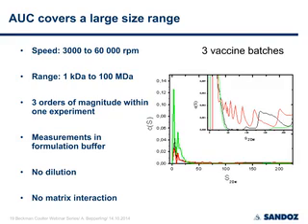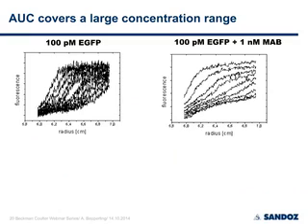The overall active species were these high molecular weight species, and they all had a different potency. So this is really useful to analyze such size distributions in the megadalton range, which is really hard by chromatographic techniques. Okay. AUC is also able to cover a large concentration range.